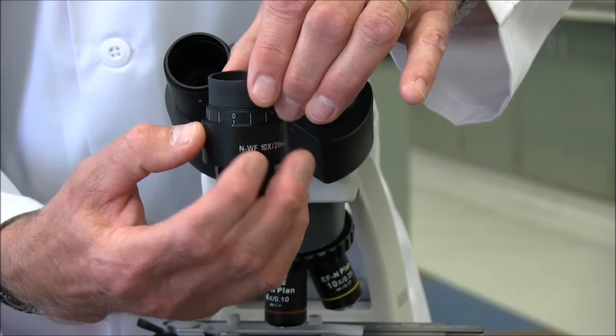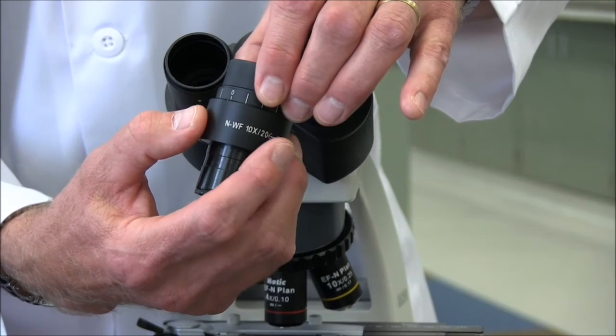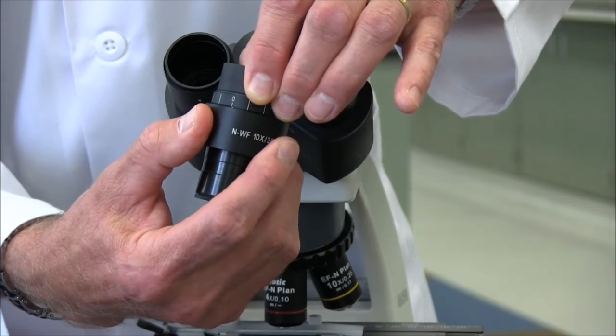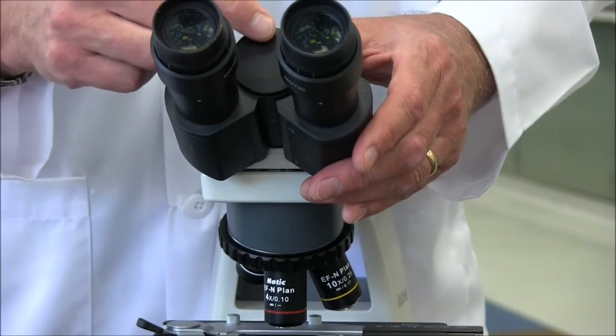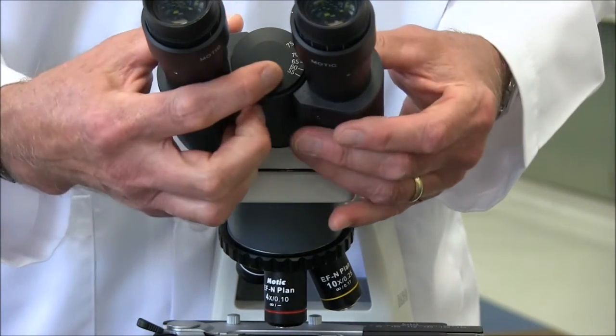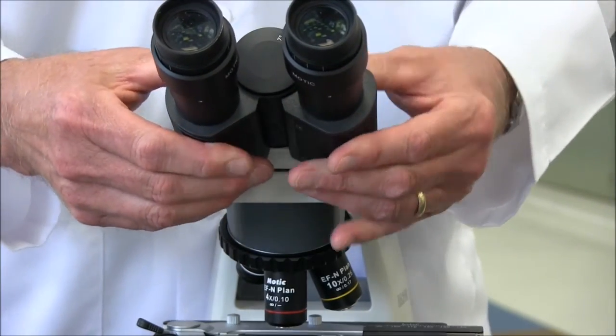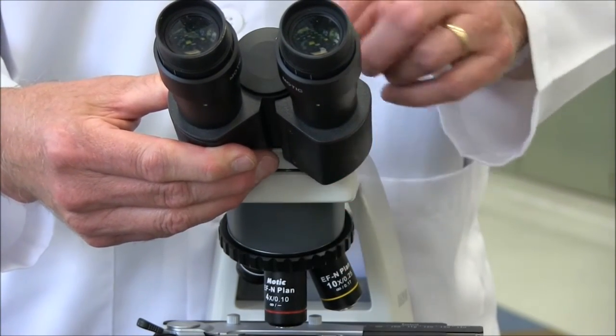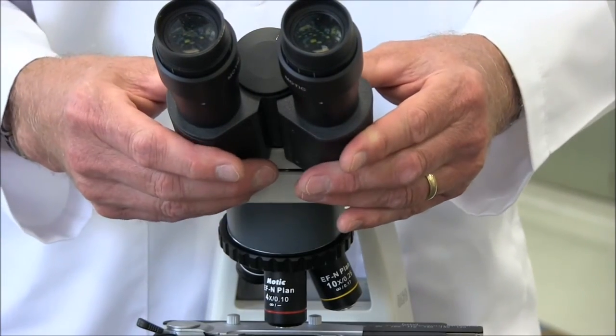If you have 20-20 vision, you would set the dot at zero and you should be able to see the specimen clearly. But if one of your eyes is weaker or stronger than the other, you can adjust it to compensate for that so that you can see the image clearly. The other scale that's important is the interpupillary distance scale, which is a scale from 55 to 75. And as the name indicates, that's the distance between your pupils. You can adjust the eyepieces until you're comfortable seeing a single image, and then make note of this number because the next time you sit down, it'll be quicker for you to set up the microscope to see the image.